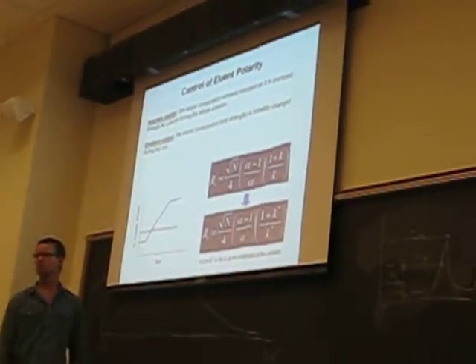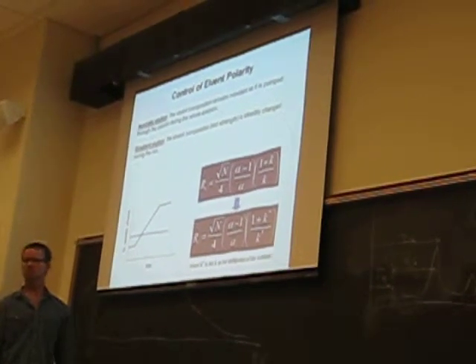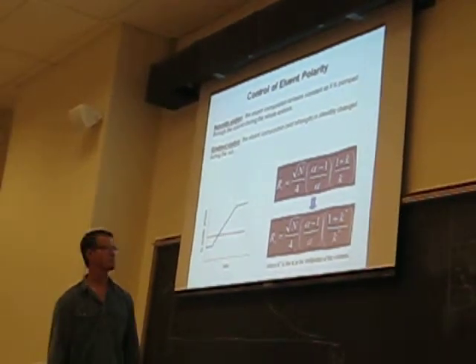And what that does, by changing the composition of the mobile phase in a linear fashion, which you can program over the elution, is that you can then more effectively select for the elution of different analytes that have quite different chemical characters. So you're doing the isocratic, but you're not modifying that. But most reverse phase HPLC applications, the majority of those, use a gradient elution profile. These two different buffer systems, phase systems.